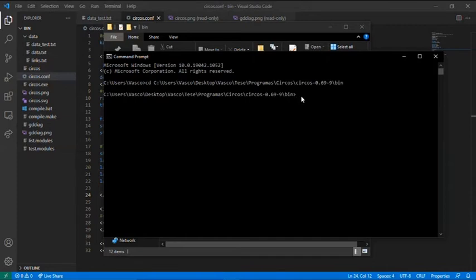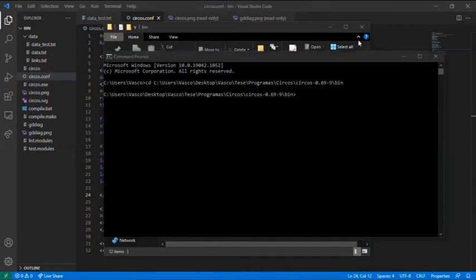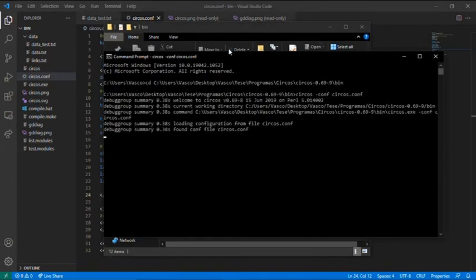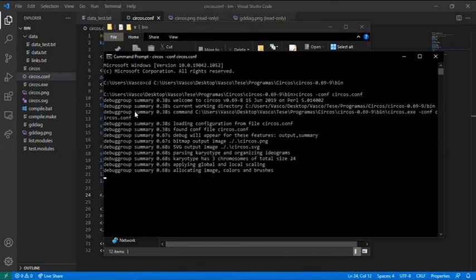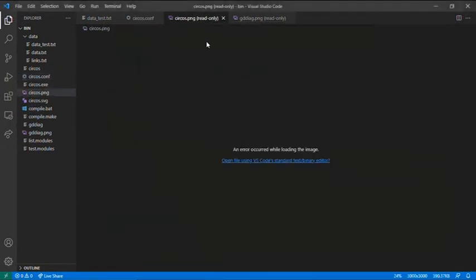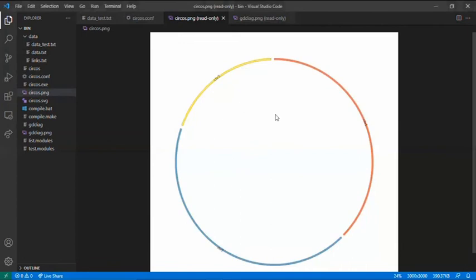Now you need to run the configuration file. How do you do this? You press circos -conf circos.conf. And press enter. Now it is processing your image. If you have your image open, you can see it is reloading. And this is the final image.